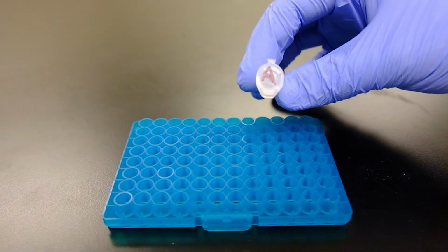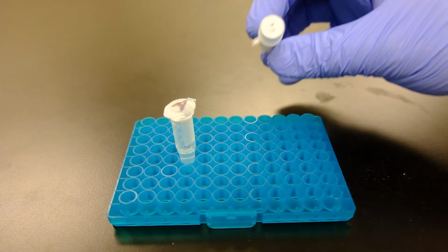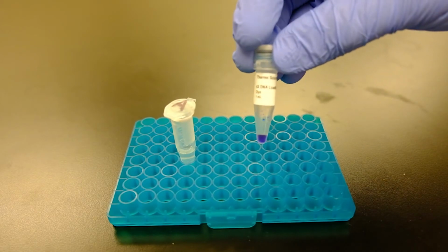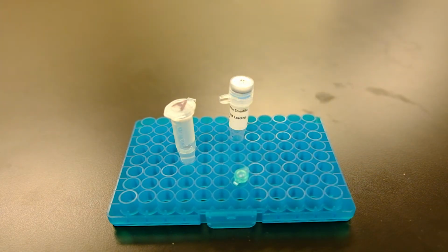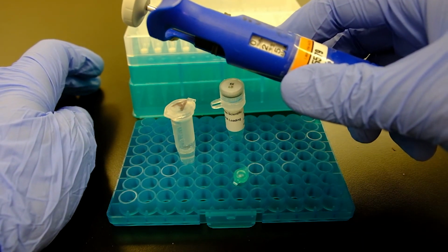Meanwhile, prepare your samples for loading. You will need first your sample, loading dye, this one is 6x, and some kind of vessel to mix the two together. Let's say I have 25 microliters of my sample left.